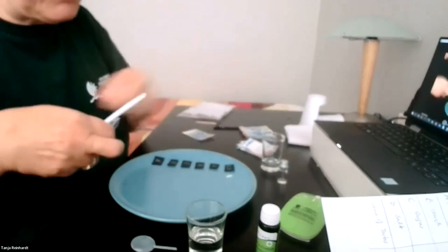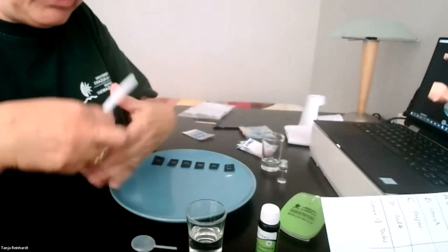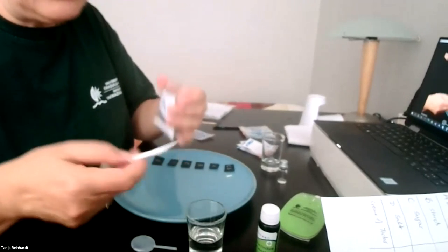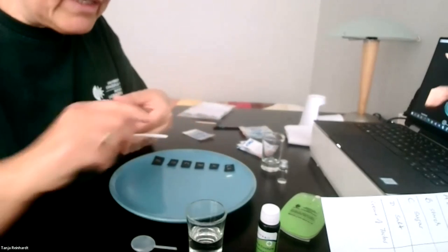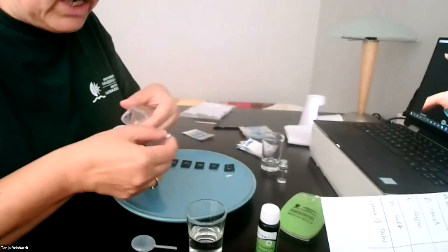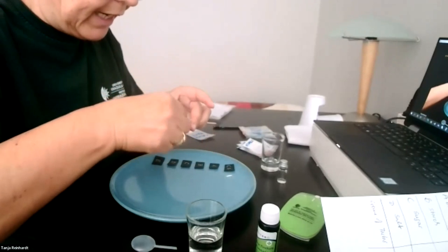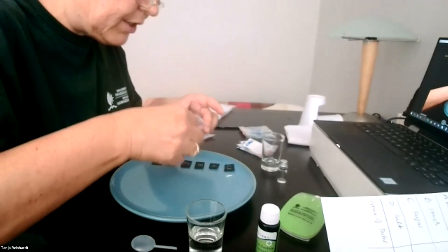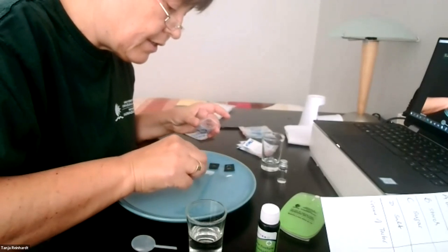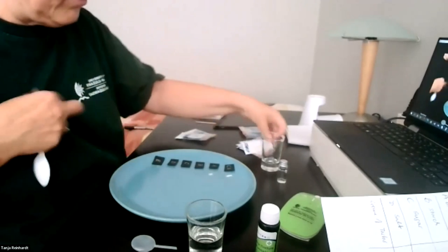Usually, in a proper lab, you would have to change the spoon, because otherwise you might get grains from your previous powder. But what you can do is just wipe it off. You can just clean it. Again, some bicarbonate. Okay. Just a tiny little bit. You don't need much.